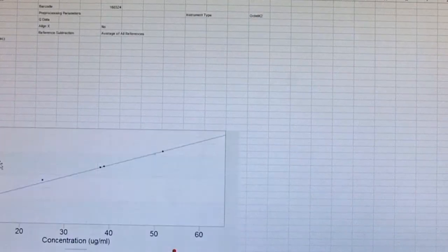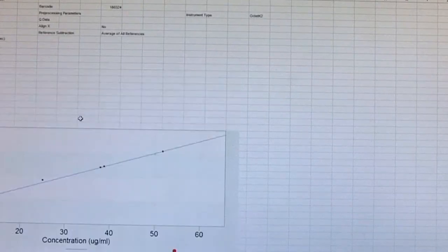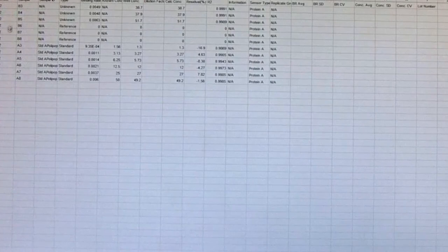And the standard curve, if you look at, this is the standard curve we had. The standard curve chi square is 0.997 and R square is 0.99. This is very good, actually, as all data points are almost very near to the line. And in the plate map where you had put the standards and the unknown samples, in the result section, this is your standard along with your percent residuals, and for the unknown samples, it is assigned as unknowns, which indicates your calculated concentration.